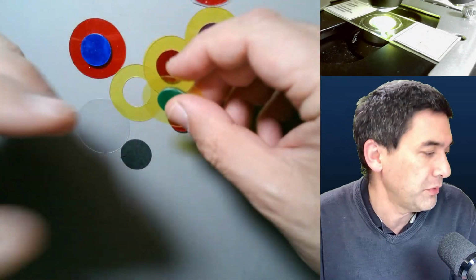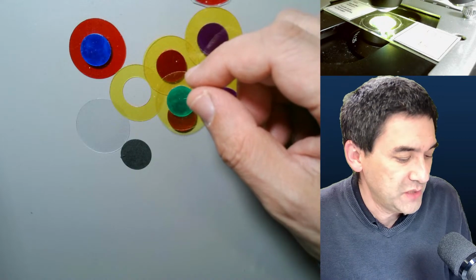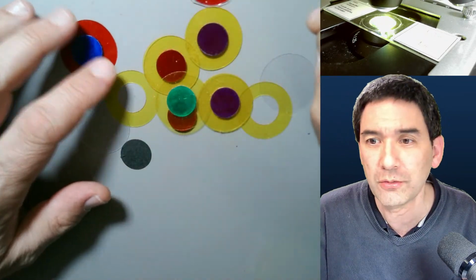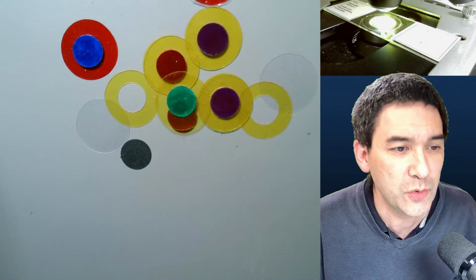So what I'm going to simply do is I'm going to just show you now how those specimens look using different filter combinations, okay? And then let's have a little bit of fun here. So what I'll do is I'll switch back over here.